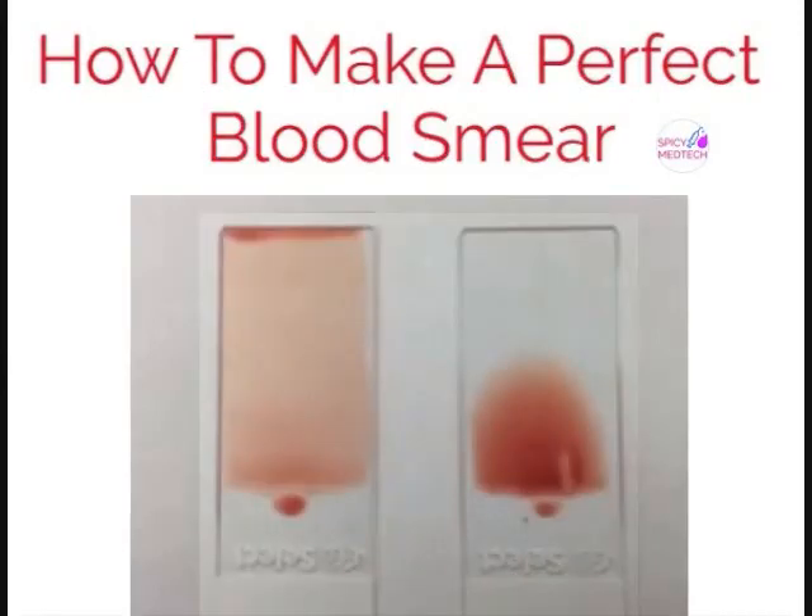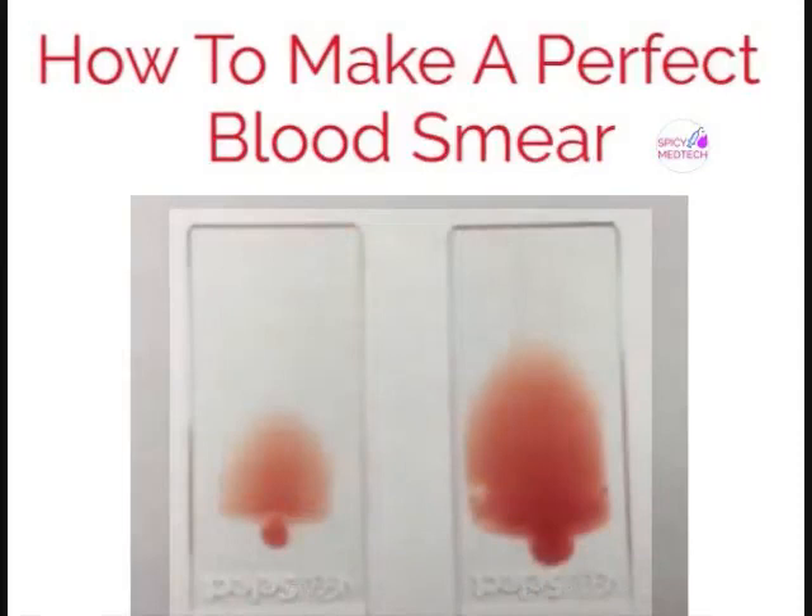The next is speed. The left slide shows what happens when you push the slide too slowly — you can see the blood accumulation at the edge. The right slide shows what happens when the slide is pushed too fast.